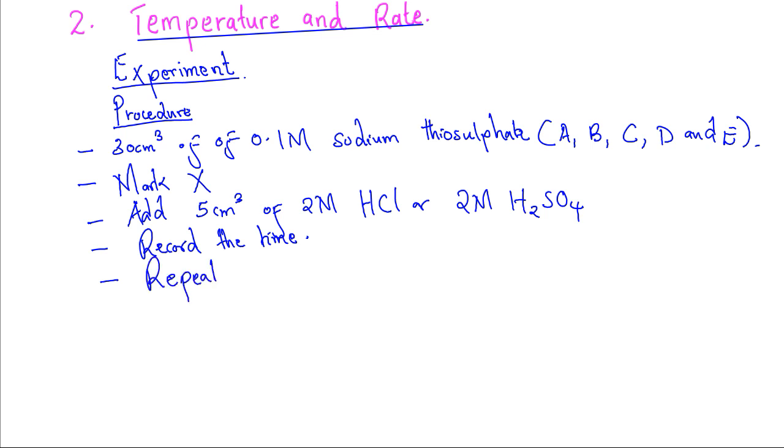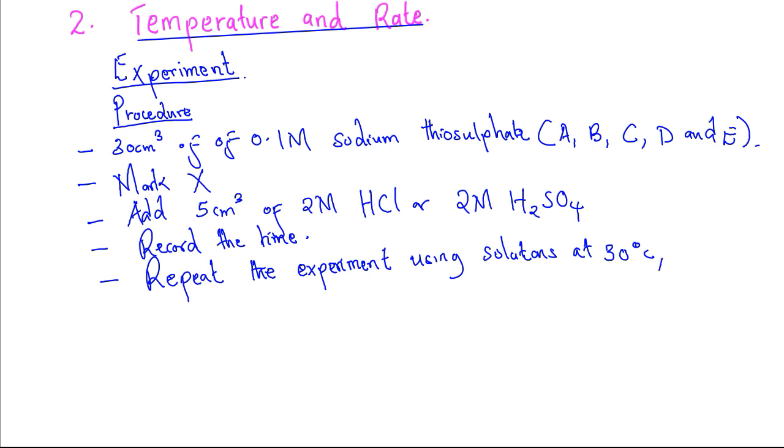repeat the experiment using solutions at 30 degrees Celsius, 40 degrees Celsius, 50 degrees Celsius, and 60 degrees Celsius.